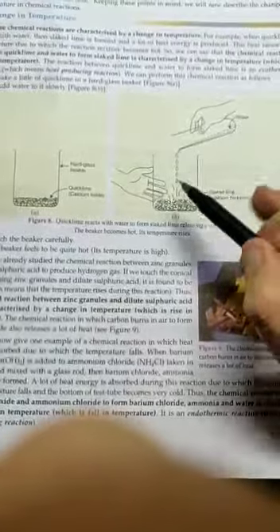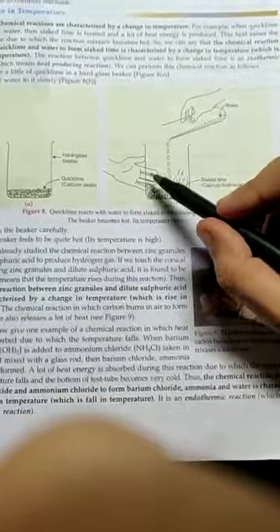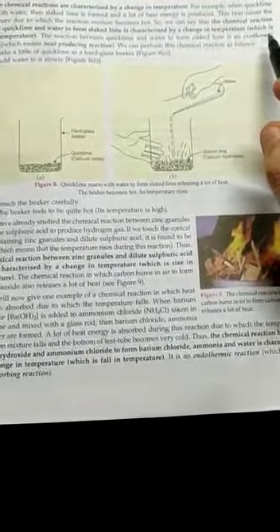CaO is called quicklime. Ca(OH)2 is called slaked lime. So here you can see, when you touch the beaker, it will generate heat. So we will call it exothermic reaction.